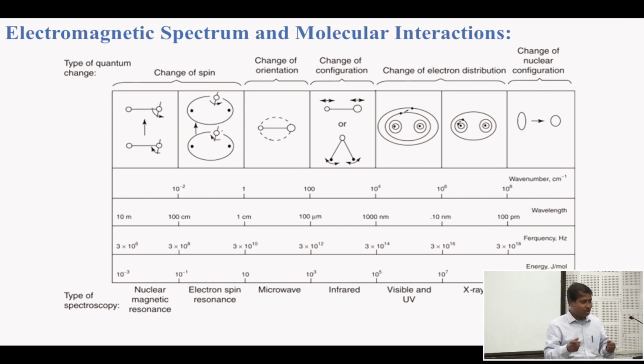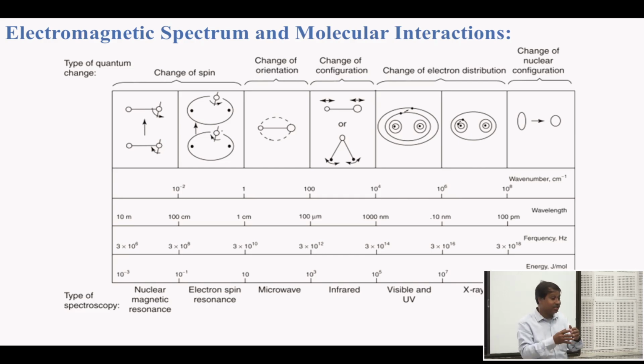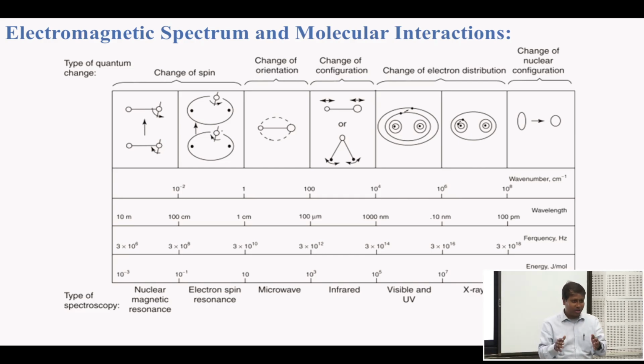The chemical system, or the system that you are making in your lab, is much easier compared to the biological system, because in a chemical system you have a solution, you take some 3 ml of, say, hexane or ethanol, anything, and you put a molecule in that and study it. You know that you have one molecule, and whatever spectra are coming, they are coming from that molecule. So you can analyze nicely, and there are no unknown factors. But when you are talking about biological tissue, you have many types of molecules, and most of the molecules you do not know.